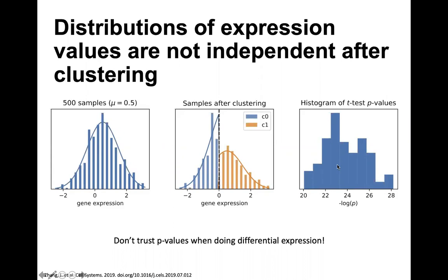And so this paper actually introduces another test that estimates basically how inflated it would be based off of a bunch of random partitions of the data. I have not really seen this being used that much. People don't really do it. I think the reason is that even that test that they're doing has a bunch of different kinds of assumptions.